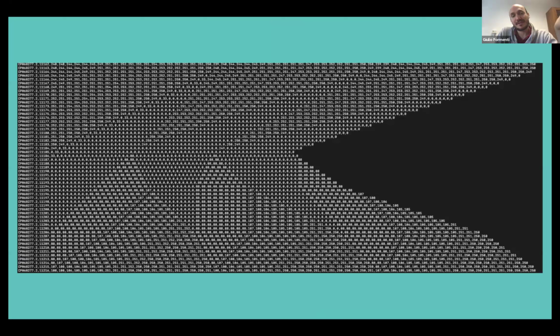We can also generate some fancy outputs that I'm not going to describe in detail, but basically for each base we can measure as much information as possible about the k-mers in the De Bruijn graph for that base. This is what we're seeing here. Every row corresponds to a position in the genome, and we're measuring the k-mer counts in the De Bruijn graph.